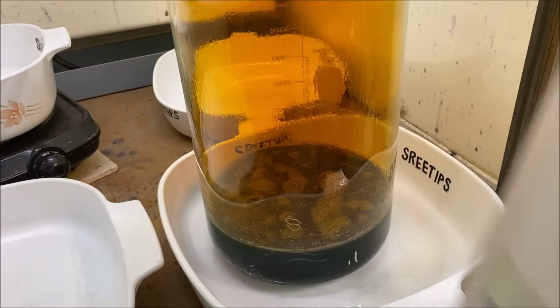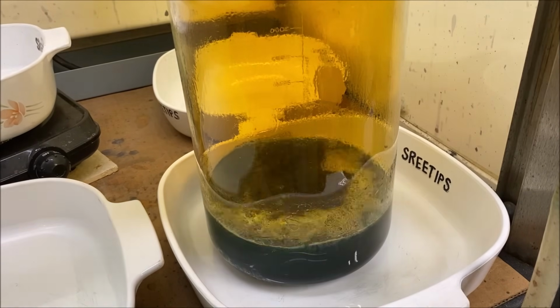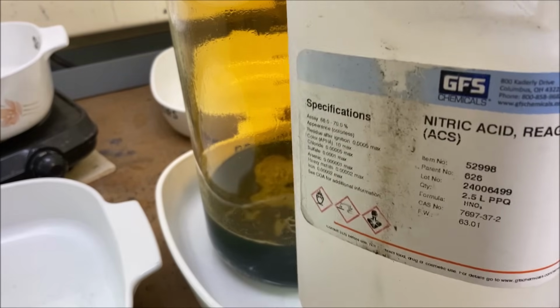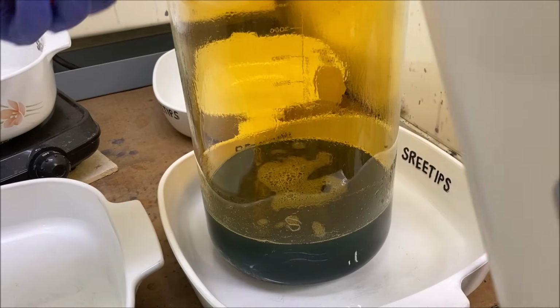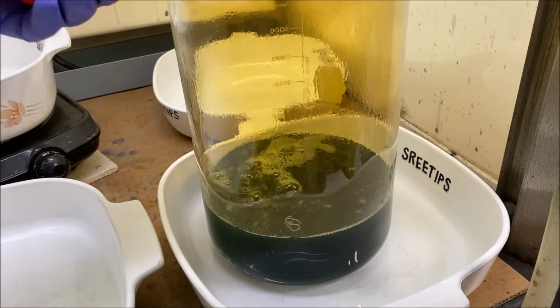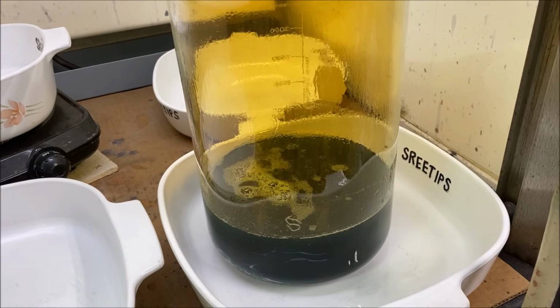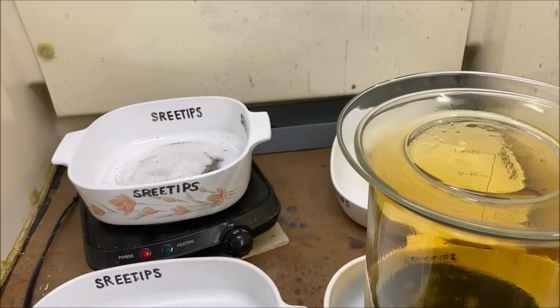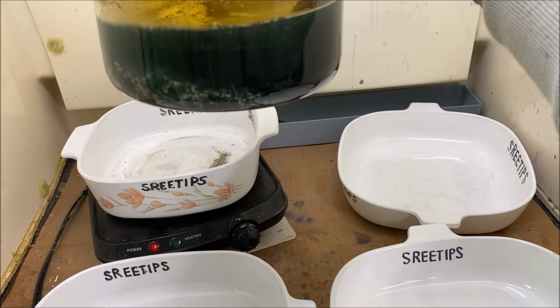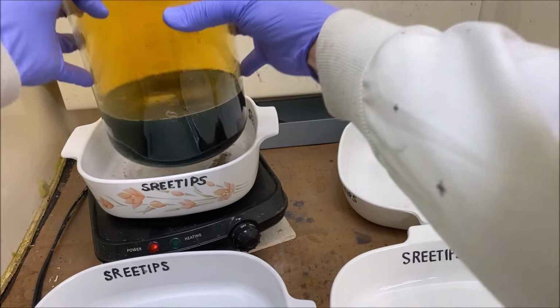This reaction's calmed down a little bit. I'm going to add another dash of distilled water and another shot of nitric acid. And now we'll set this up on the heat over here and start adding a little bit of heat. There's our material down in the bottom of the beaker. See if we can get all this to dissolve.